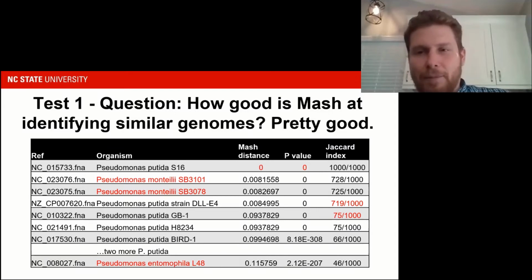You'll notice that the output of MASH is a little different than FastANI. Rather than giving us a bidirectional frag mappings value and a total query frags in separate columns, MASH gives us a Jaccard index value in one column. This is independent of genome length. Remember though, MASH penalizes in the Jaccard estimate, which ultimately impacts the MASH distance.